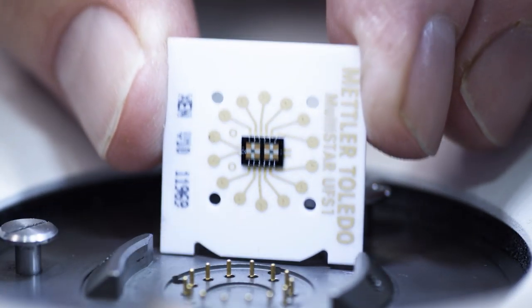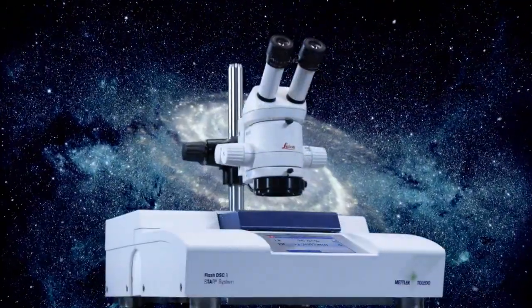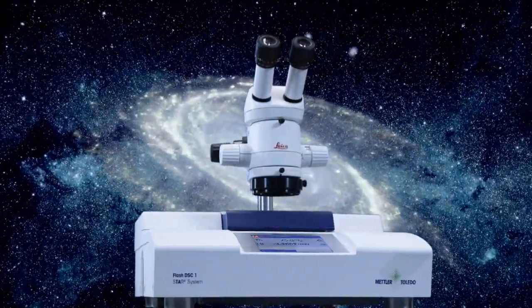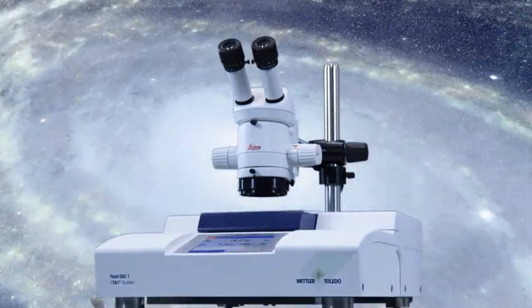Innovative technology, versatile modularity and Swiss quality. The Mettler Toledo Flash DSC-1 represents a quantum leap in thermal analysis and revolutionizes fast scanning DSC.